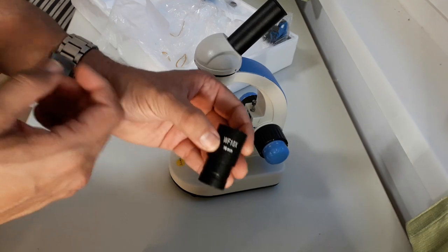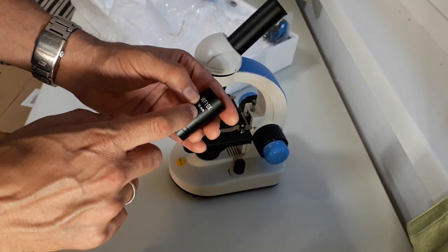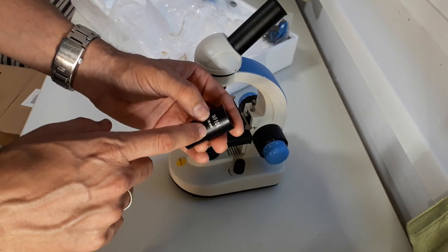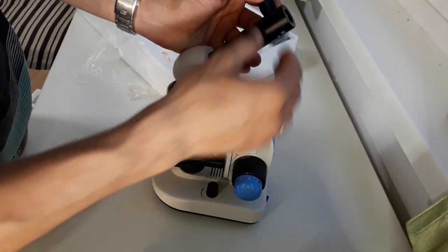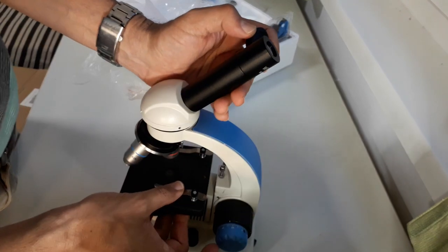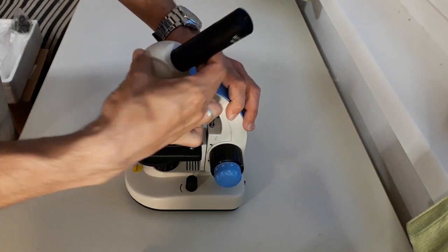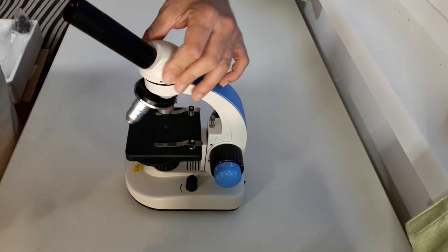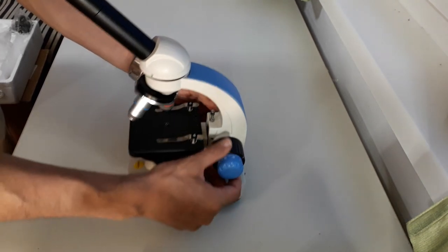microscope. This is now a 10 times magnifying eyepiece. The eyepiece is pretty good. It is also made of metal. And the 16 millimeter, that is the field of view. There is a protective tube cap, and it simply drops into the tube like this, and the microscope is ready for operation, and also the tube can be turned. It works very smoothly this way.